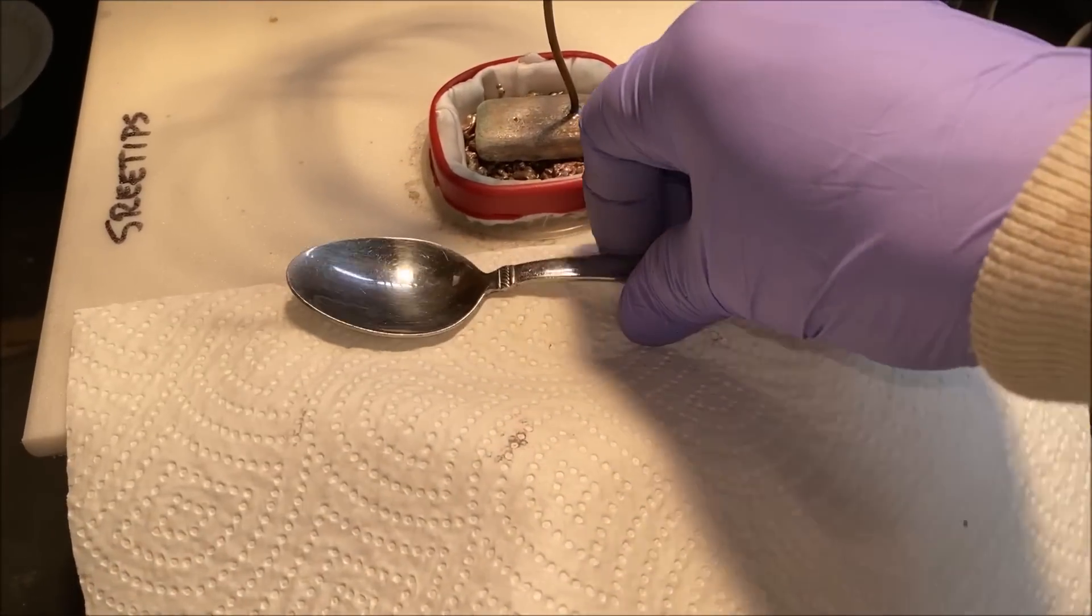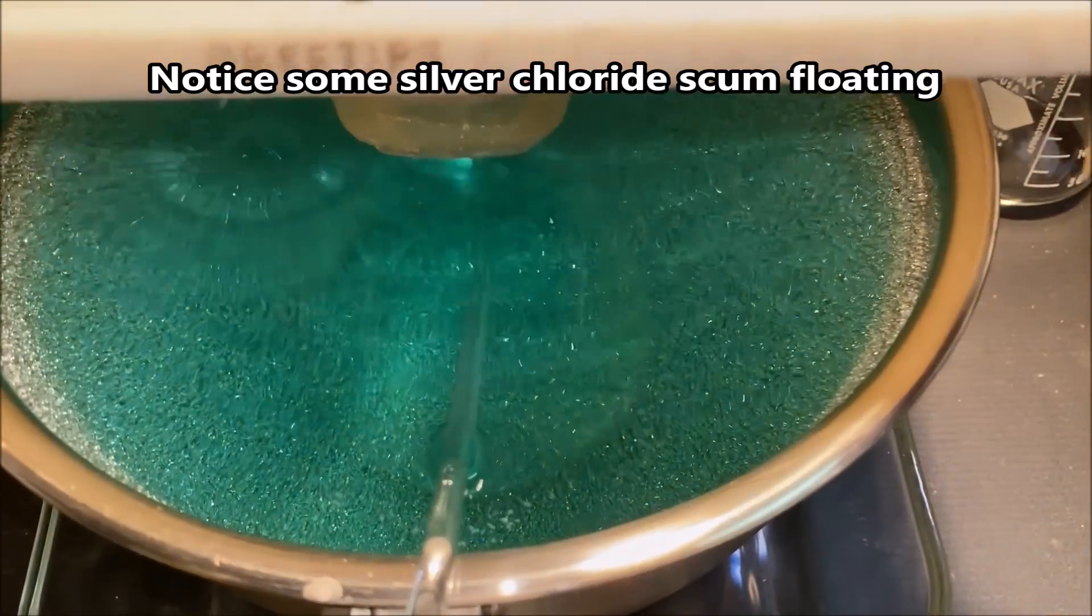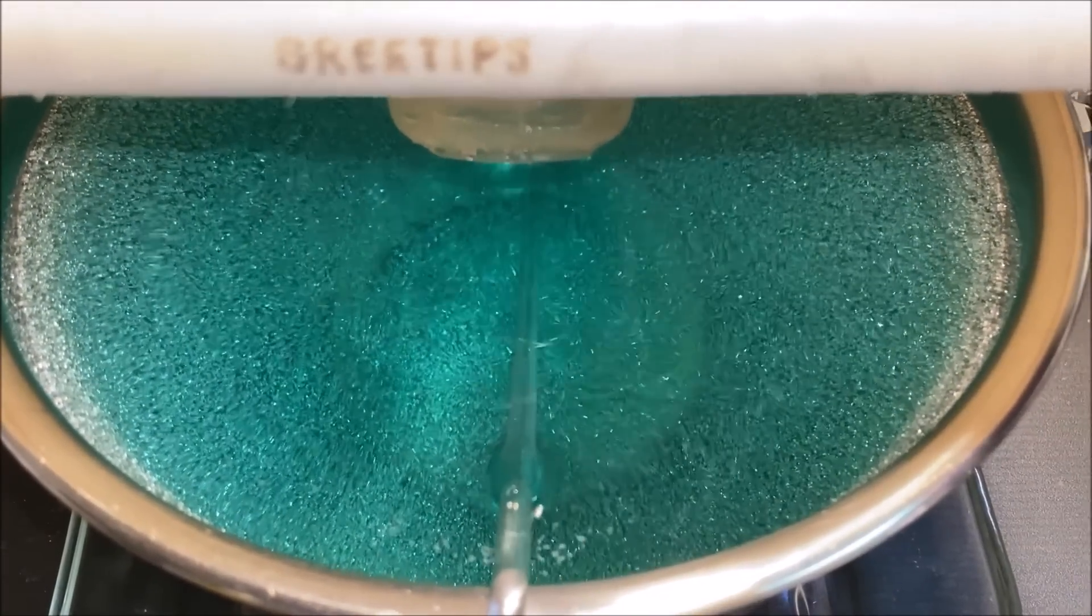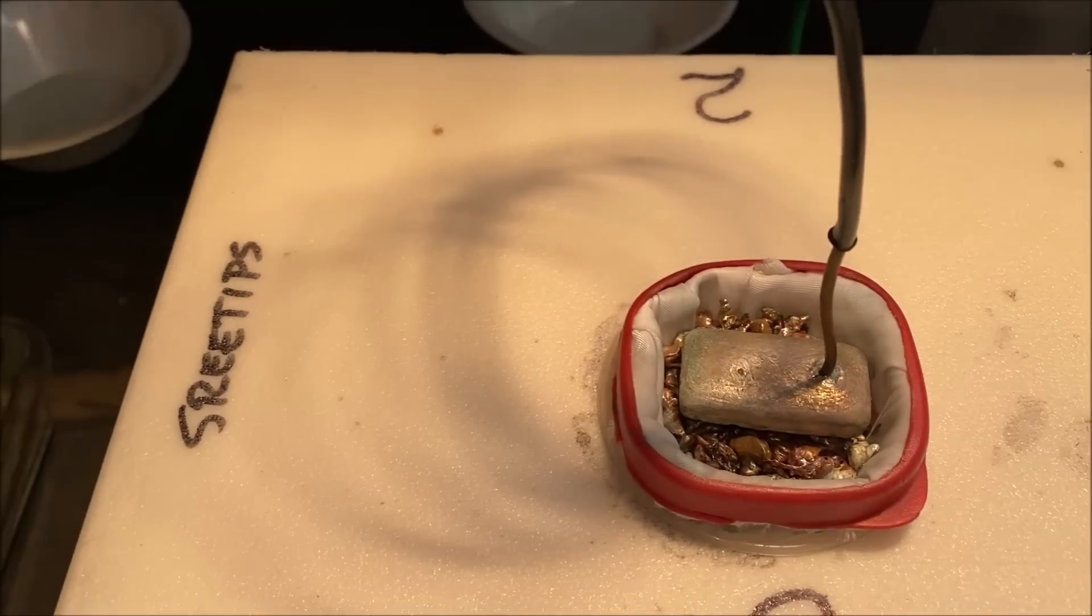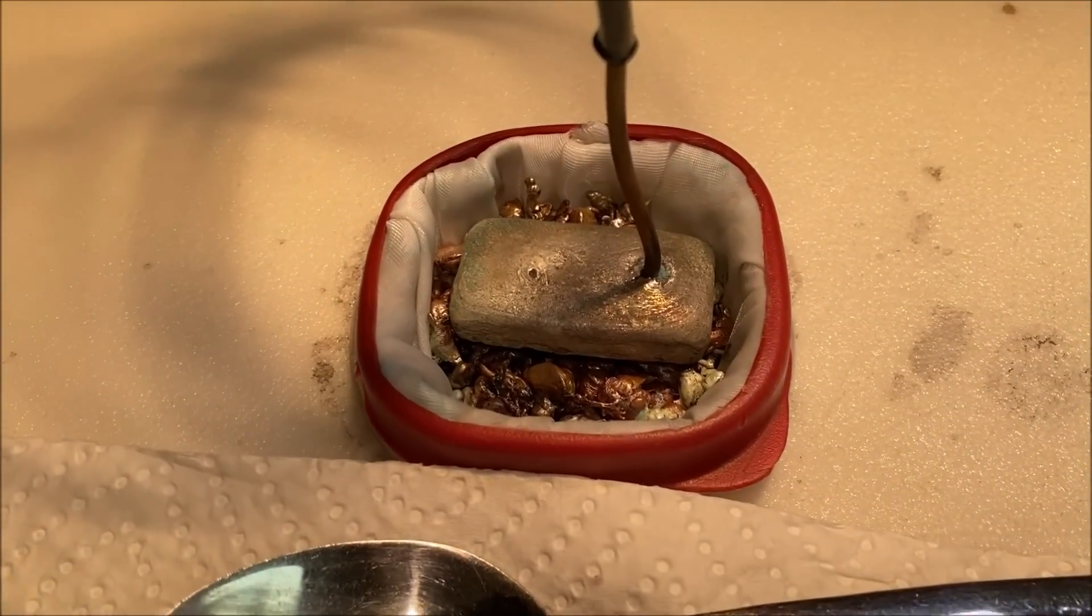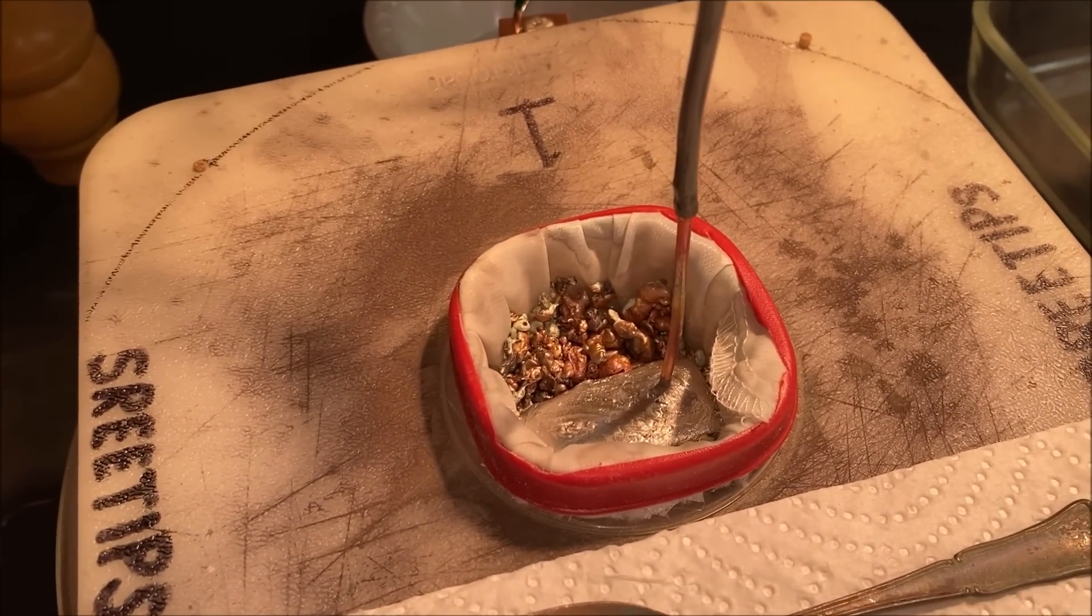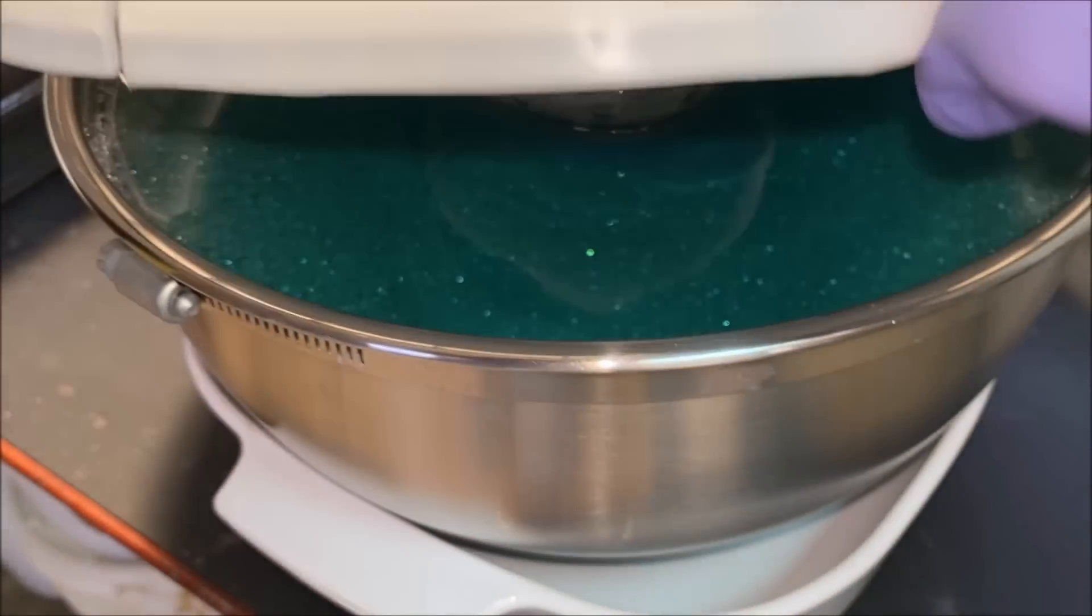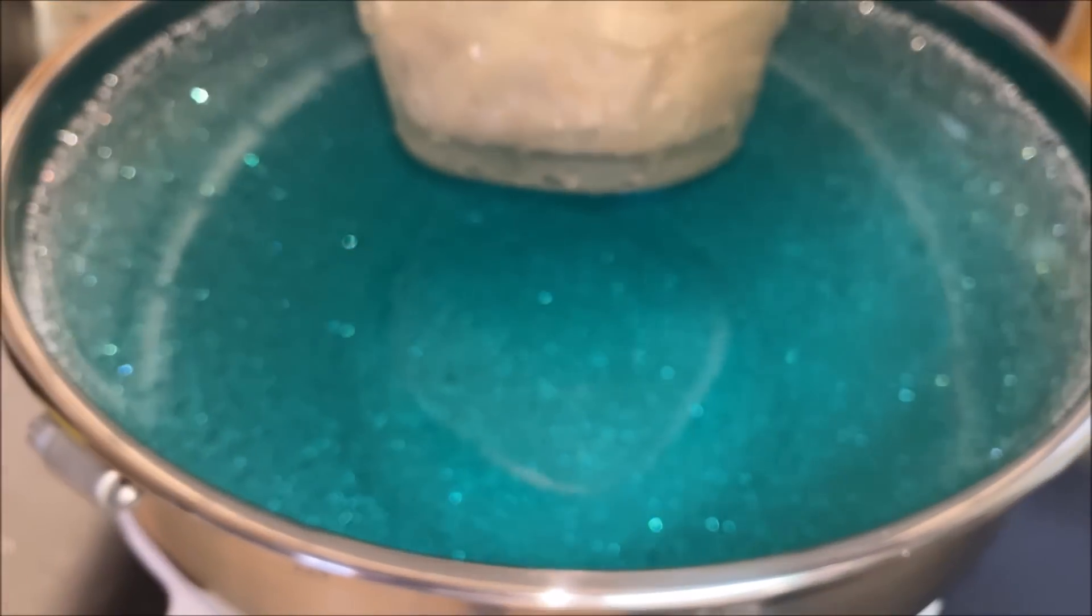Oh yeah, look at that beautiful pure silver crystal. Let's have a look down inside cell number two. That don't look too bad either, but it's quite obvious that cell number two has not consumed as much impure silver as cell number one has.